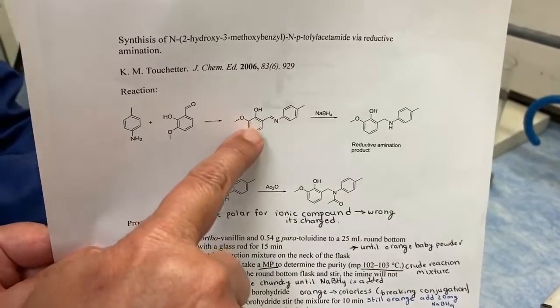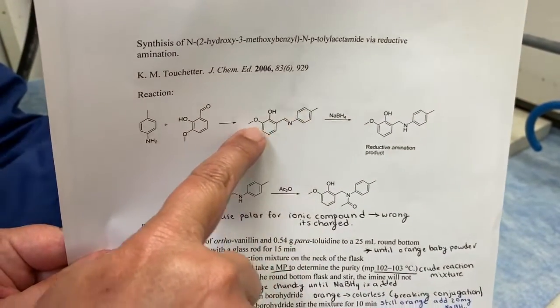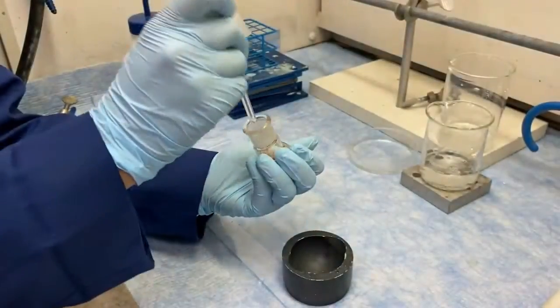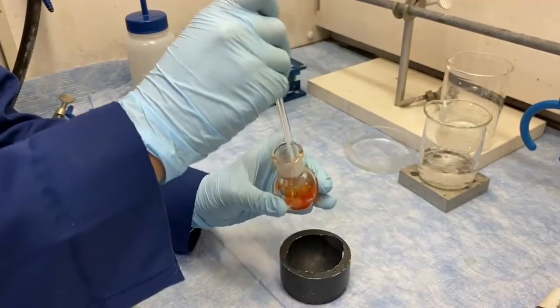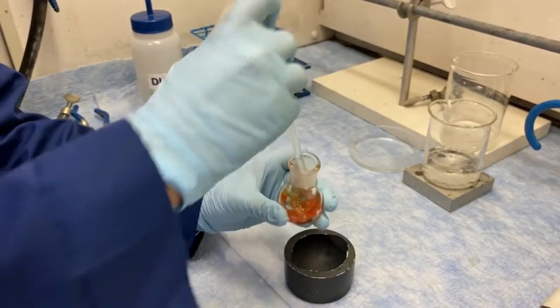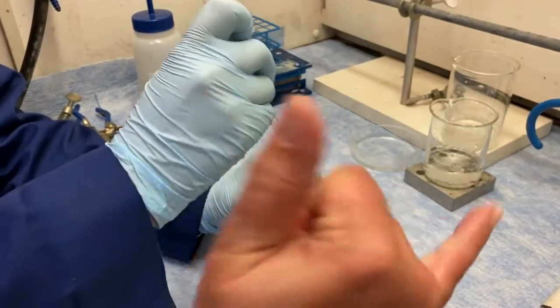And again, you can see how it's completely conjugated, just like we saw in the aldol condensation lab. We're seeing total conjugation result in a very drastic color change to rowdy orange. Go Runners.